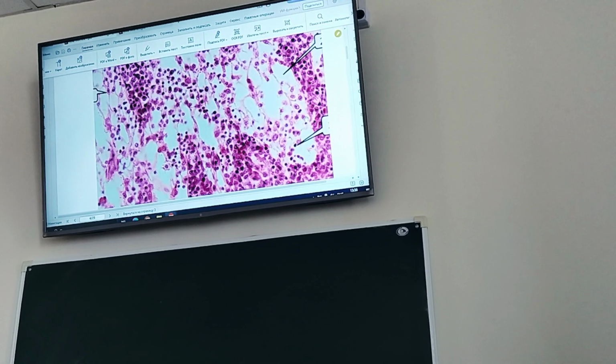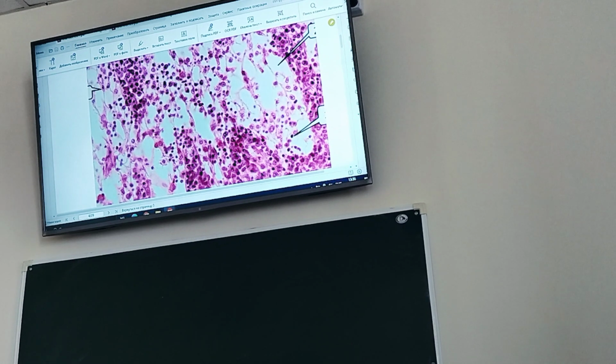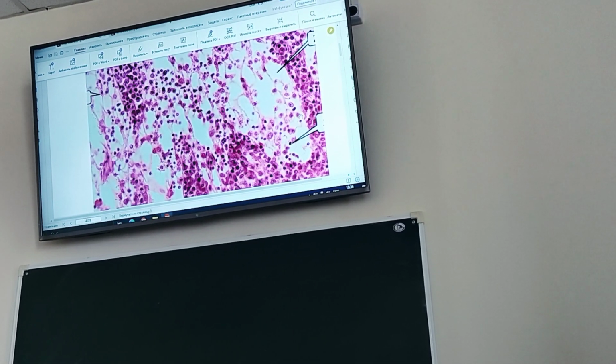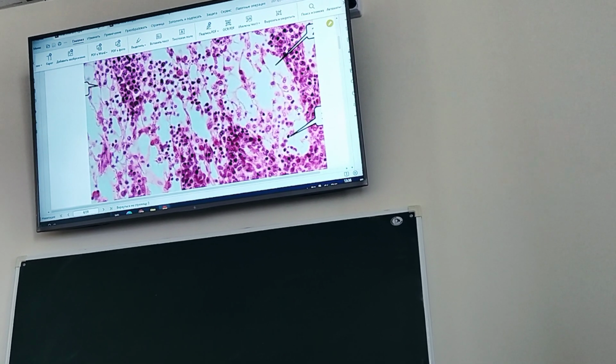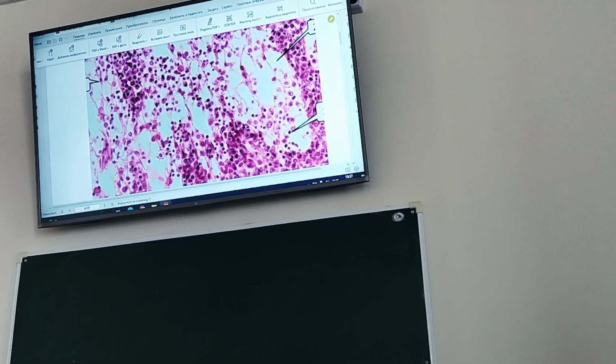Specialized connective tissue. We need to explain. So this is specialized reticular connective tissue taken from a lymph node, the stroma of the lymph node. What may be an explanation? How can you confirm your choice?